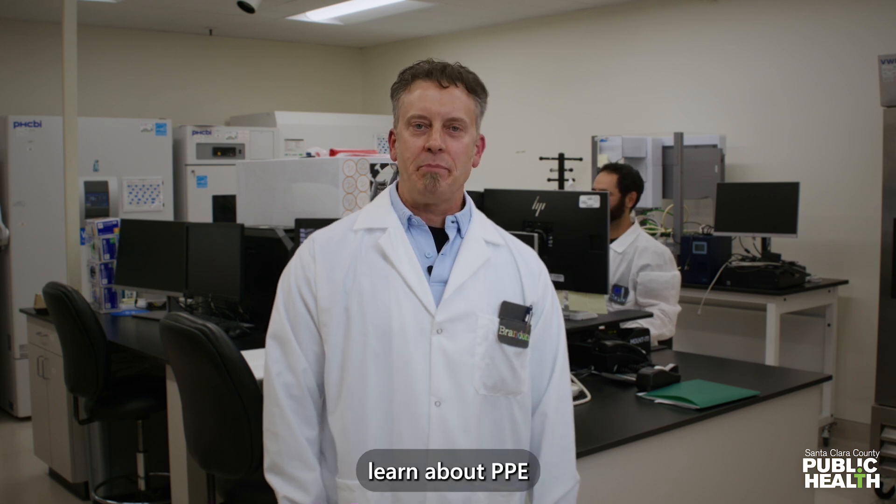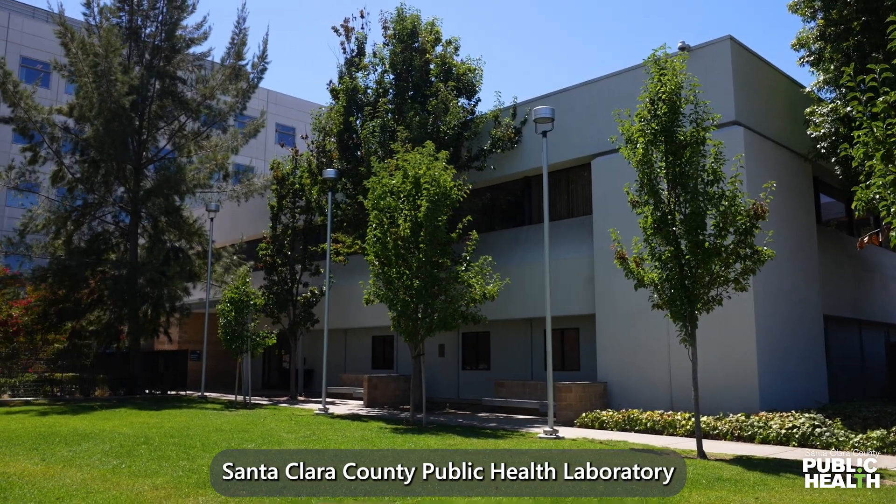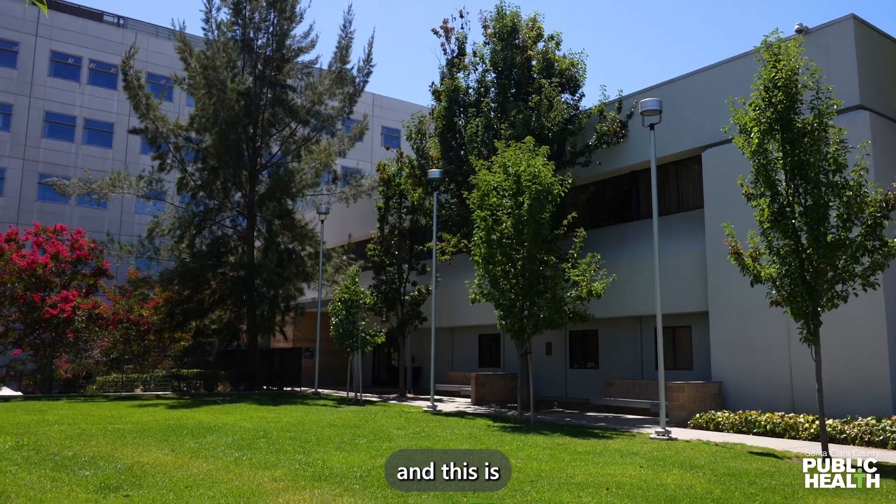Hi, in this episode we're going to learn about PPE. We're here at Santa Clara County Public Health Laboratory, and this is Brandon in the lab.